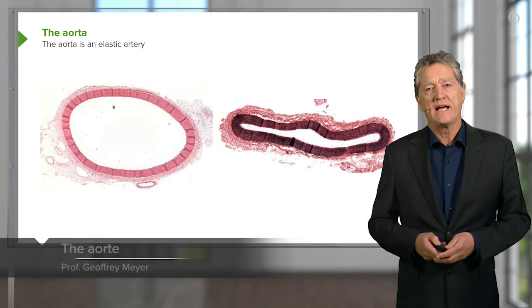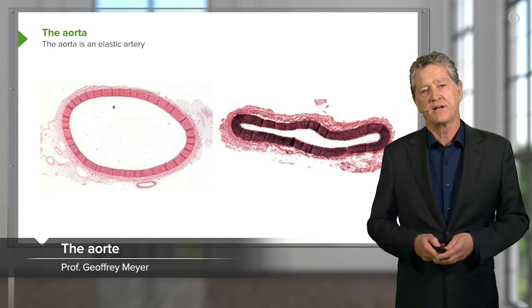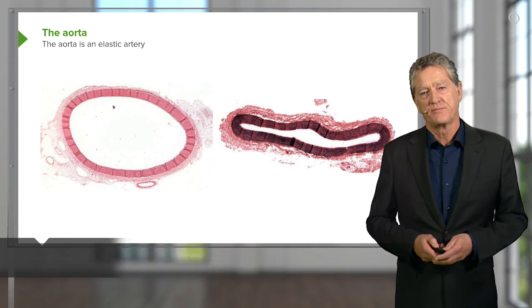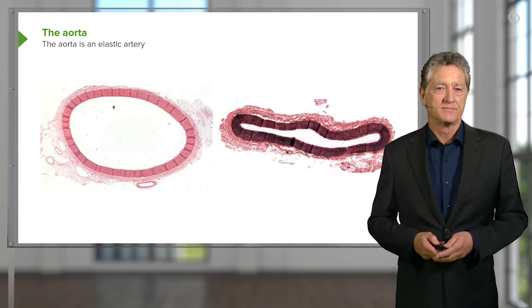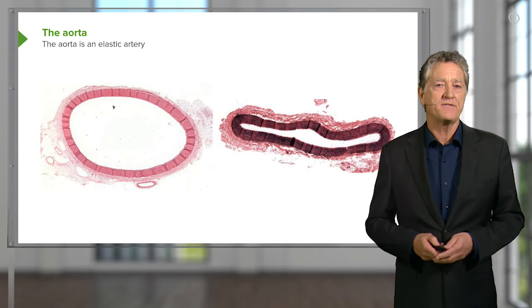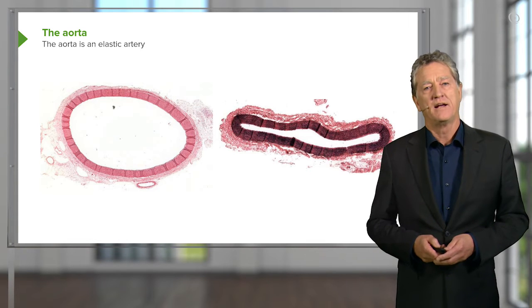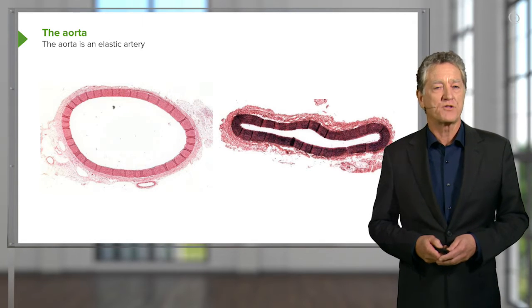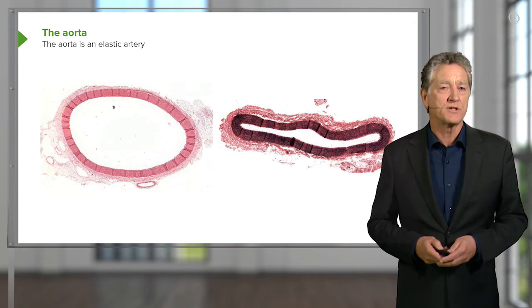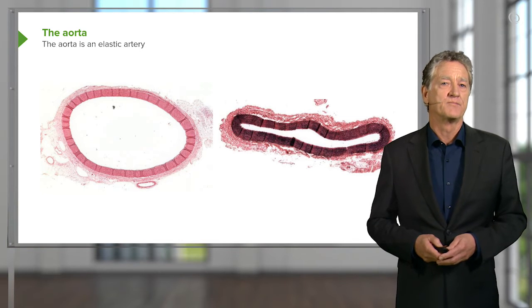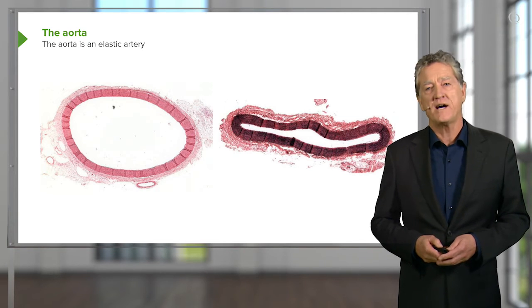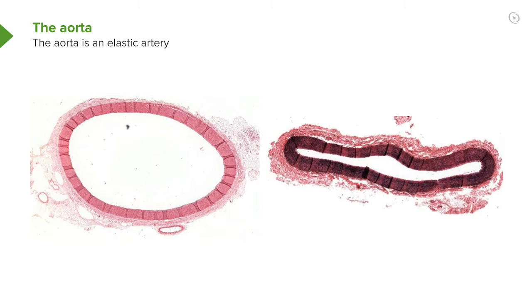Let's look at the aorta and the vena cava. They are very special blood vessels. Here's a section of the aorta. On the left-hand side it's sectioned, and it has been stained with normal hematoxylin and eosin. On the right-hand side, it's a bit collapsed, but that happened during the processing.